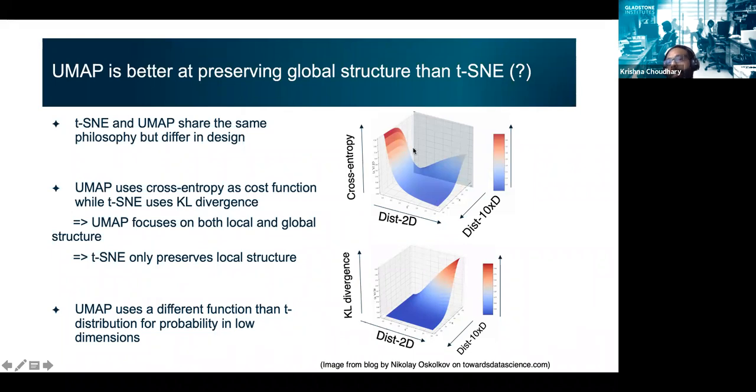But this algorithm is working on tens of thousands of cells together simultaneously. So there will be some trade-offs. Some cells may not be placed accurately in close to their neighbors in the interest of reducing the cost for some other pairs of cells. So this is an optimization algorithm, and it depends on how many iterations of optimization you do, and what size of steps the algorithm takes.